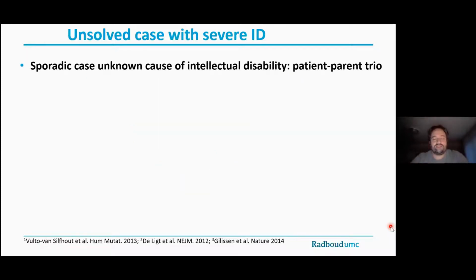And this is really illustrative for a larger series of experiments that we usually do. The model disease that we study a lot is severe intellectual disability. And that, especially in the Western and outbred population, is very often a sporadic disease and very often is caused by de novo mutations of all kinds. De novo point mutations, as well as de novo structural variants. And to find those more systematically, we study patient-parent trios a lot. So affected patients and the unaffected parents are run in parallel.